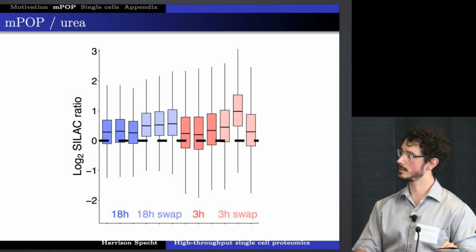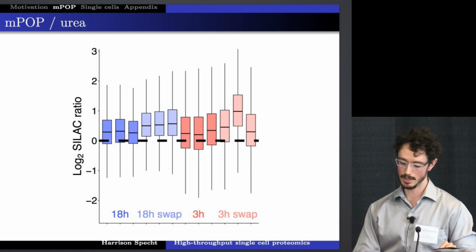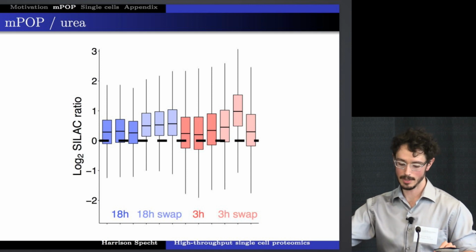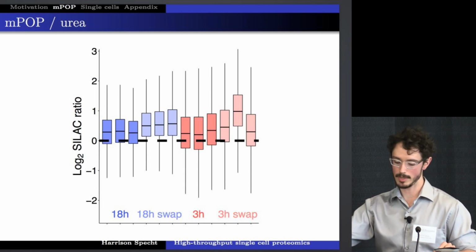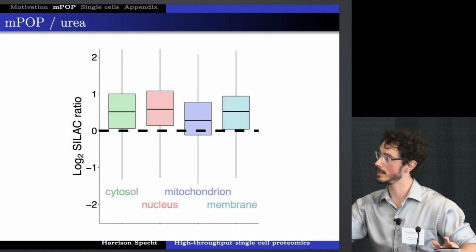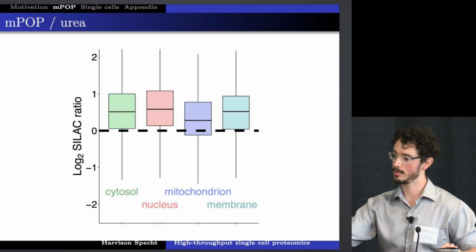What we can do then is take this data and look at subsets of it, mapping the proteins to their gene ontologies and extracting out the different cellular compartments and looking at the ratios then. We did a couple here. We looked at membranes in particular, and we found again that they compare very favorably. I'd be curious to hear more about the different ontologies that may or may not be representative.